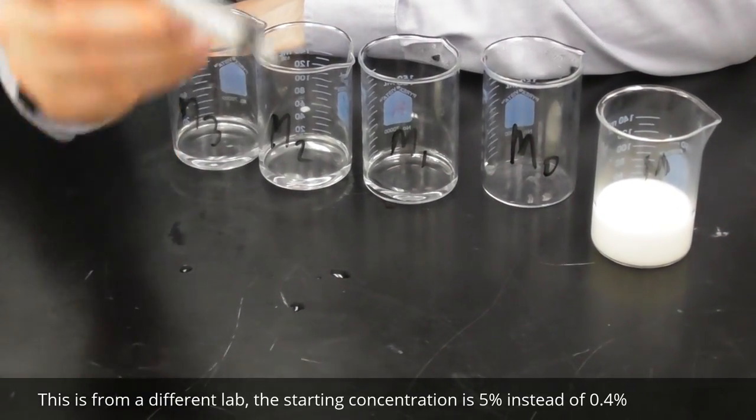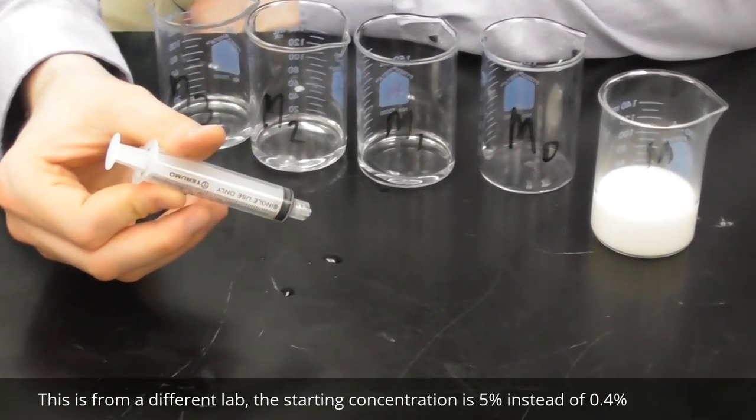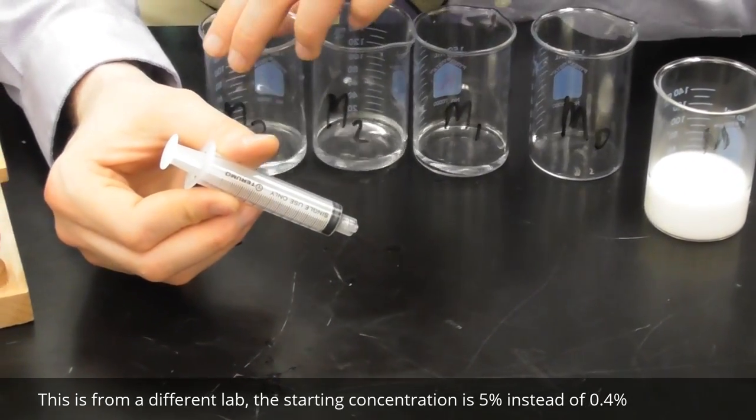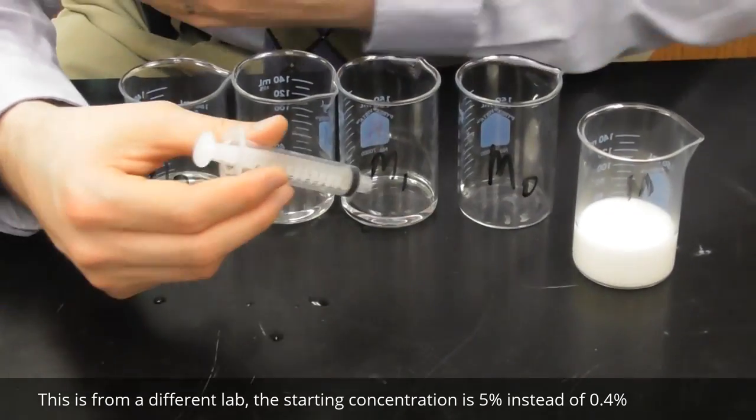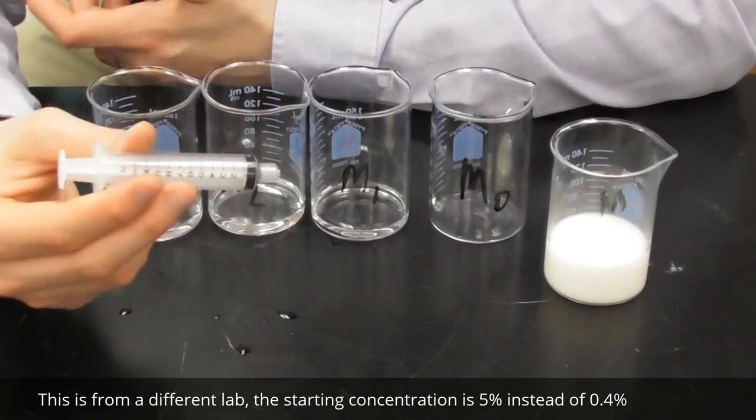I don't need to rinse this. I just need to wipe off the water. That's all I need to do. I have now all of the dilution that I'm going to need.